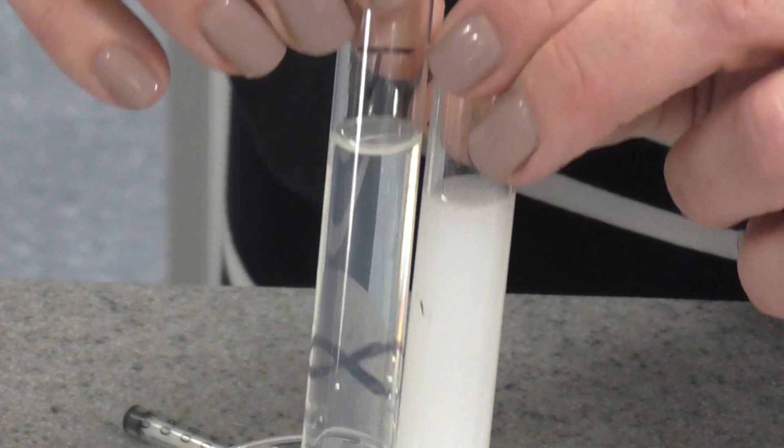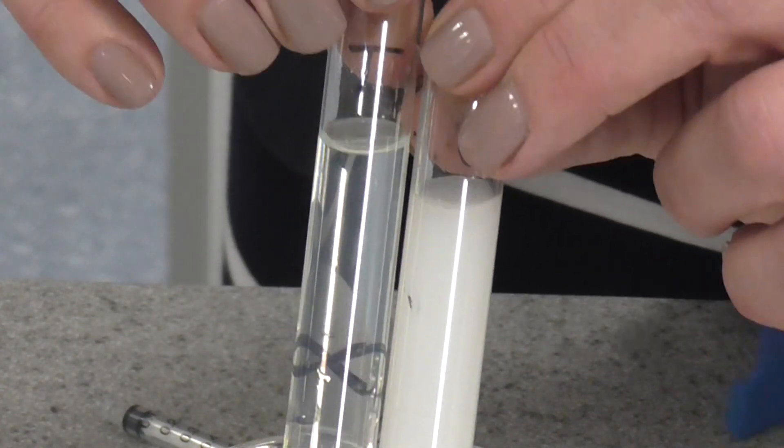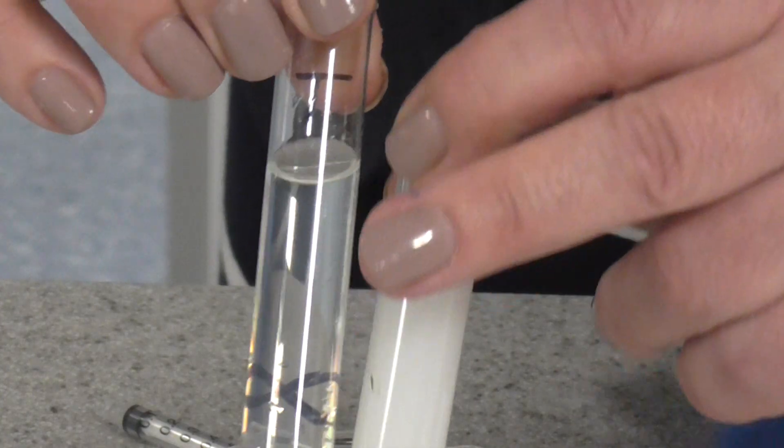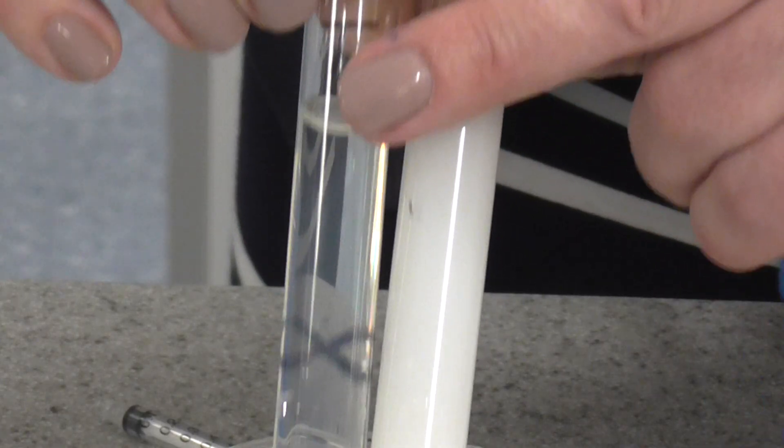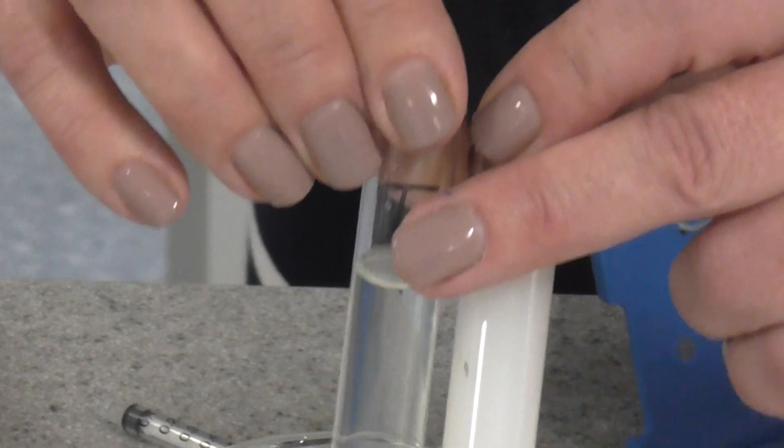So what you're timing here, the end point of this reaction, will be the point at which you can actually see the X. So you need to watch them very carefully, and as soon as the X becomes visible, you stop your timer, and that is the time that you record.